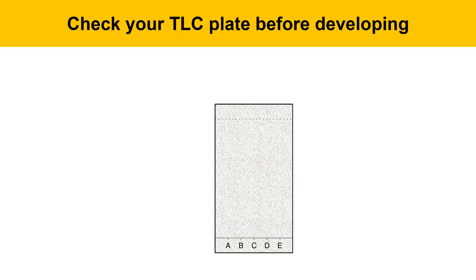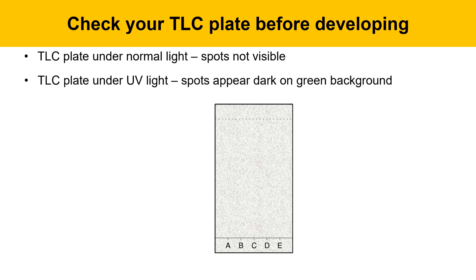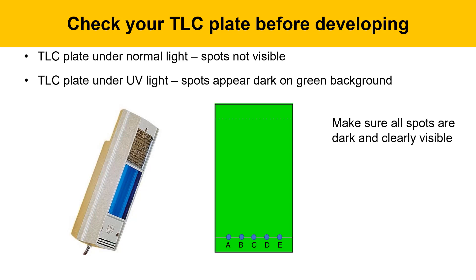Check your TLC plate before developing to make sure the spots are visible. The plate shows no spots under normal light because the spots are colorless, but under UV light they appear as a dark circle on a green background. When you shine a UV lamp on the plate, it should look like dark blue spots at the baseline. Make sure all spots are dark and clearly visible — if any spots are faint, spot them again with another coat.